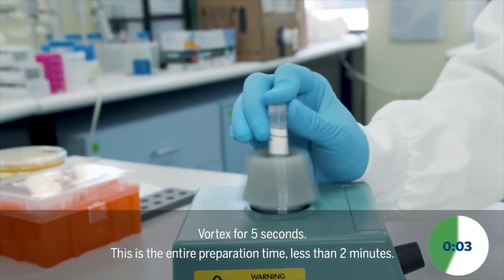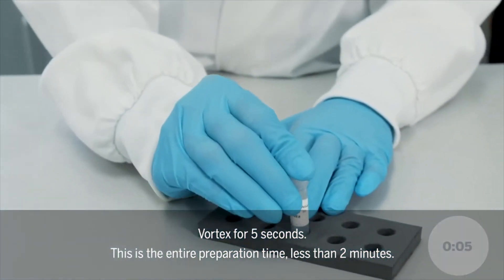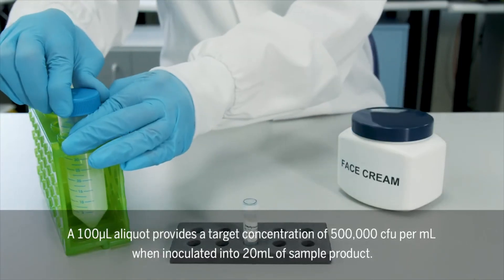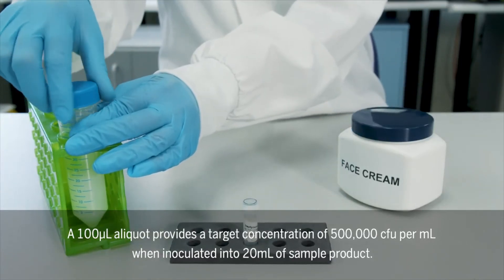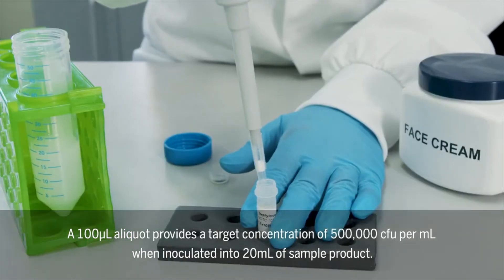Vortex for 5 seconds. This is the entire preparation time — less than 2 minutes. A 100 µL aliquot provides a target concentration of 500,000 CFU per milliliter when inoculated into 20 milliliters of sample product.